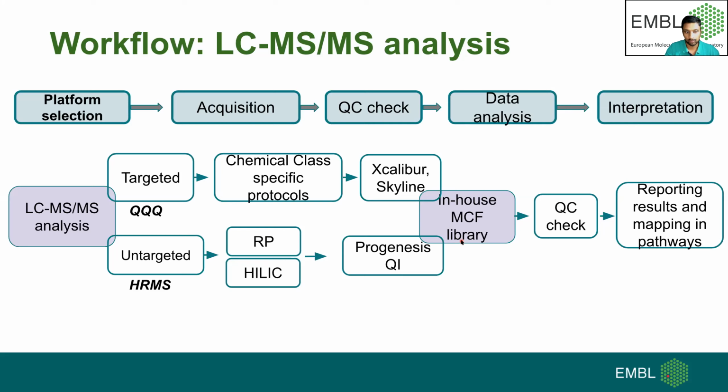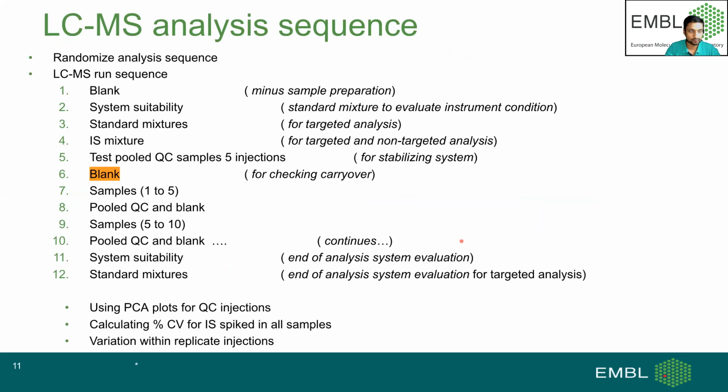Like proteomics, it is very straightforward. You have to match your peptides, which you will see from the next speaker, like how proteomics is much standardized, but metabolomics is not as standardized. Then you should have a quality control check whether the analysis was okay, whether it is reproducible, whether my quality control samples are passing or not, and then you go for interpretation and actually getting some biological information out of that data.